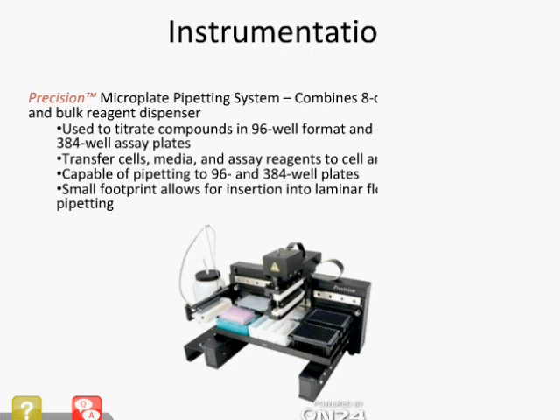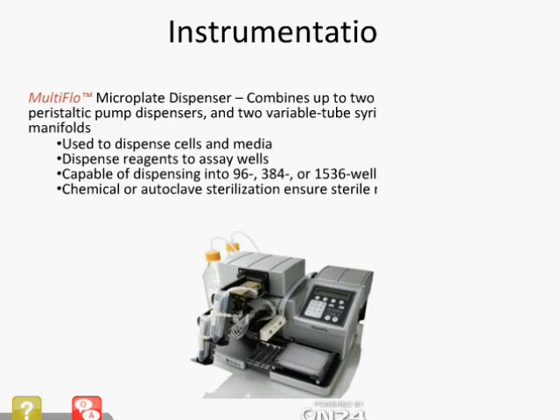The next instrument is our MultiFlo microplate dispenser. It combines up to 2 8-tip non-contact peristaltic pump dispensers and 2 variable tube syringe pump dispense manifolds. And for 2 of the projects, it was also used to dispense cells and media as well as reagents. It does this through non-contact dispensing, and it's capable of dispensing into 96, 384, or 1536-well plate formats.